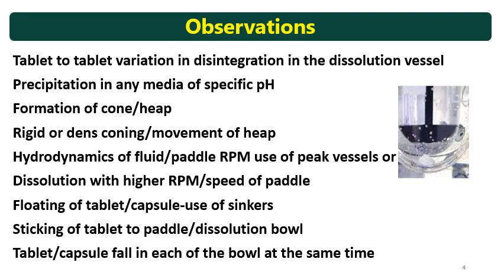The heap should be observed — whether it is rigid and dense or whether it is moving. This is very important. Some formulations are made with a tablet weight of around 1000 mg, and those tablets may form a heap that moves slowly or may be rigid. Based on that coning, you can observe whether the hydrodynamics are sufficient. Based on the hydrodynamics, paddle RPM can be selected or increased, or a peak vessel or higher paddle speed can be used.